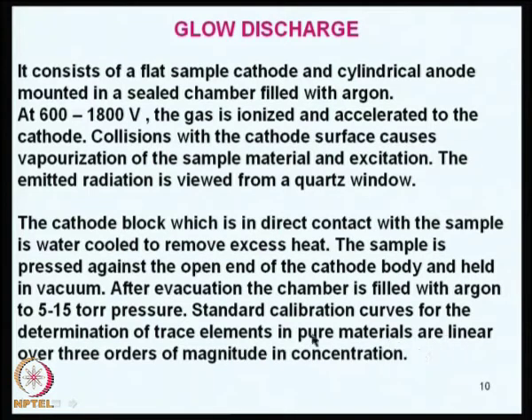The linearity is over 3 orders of magnitude. So, 0.1, 1% and 10%. So, 2-3 orders minimum: 10 raised to minus 2, 10 raised to minus 1, 10 raised to 0, and maybe 10 raised to 1 sometimes. It is possible to determine the elements using glow discharge.